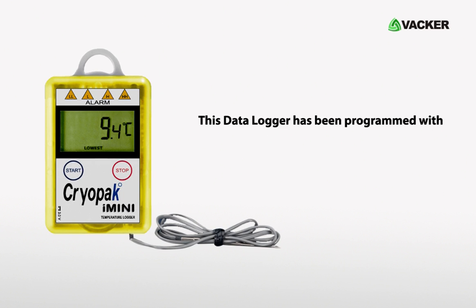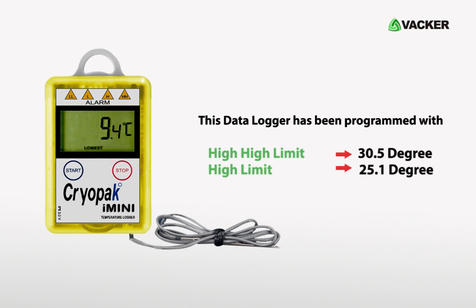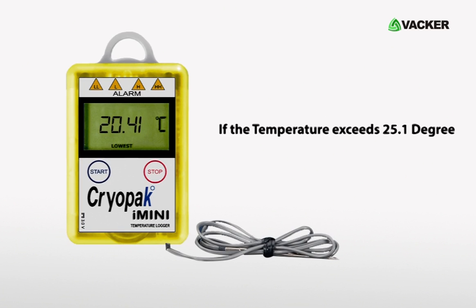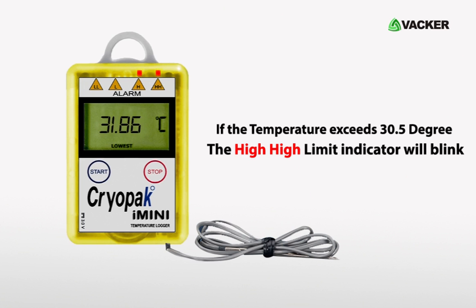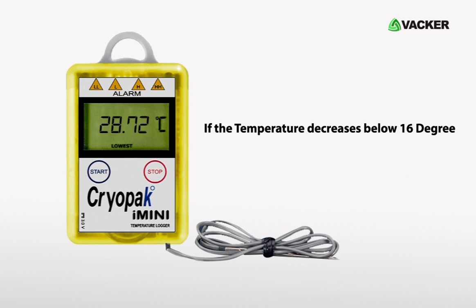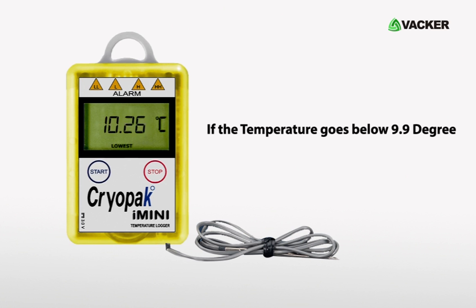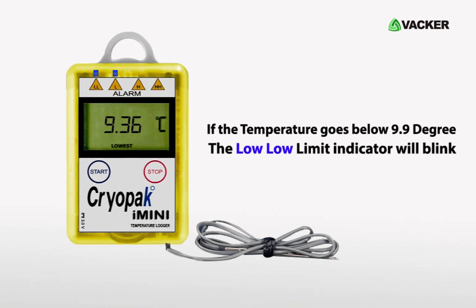This data logger has been programmed with a high-high limit of 30.5°C, a high limit of 25.1°C, a low limit of 16°C, and a low-low limit of 9.9°C. If the temperature exceeds 25.1°C the high limit indicator will blink; if it exceeds 30.5°C the high-high limit indicator will blink. If the temperature drops below 16°C the low limit indicator will blink, and if it goes below 9.9°C the low-low limit indicator will blink.